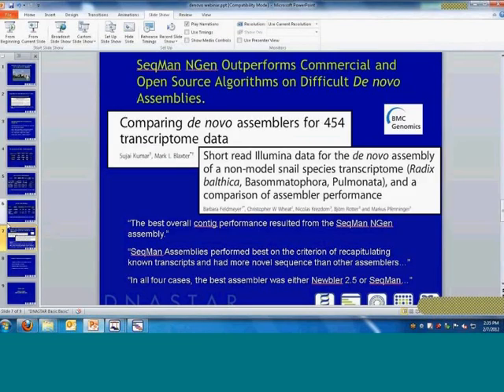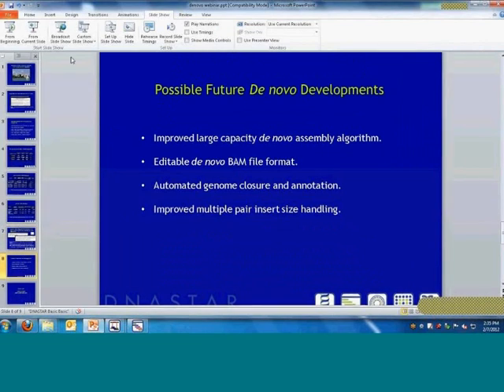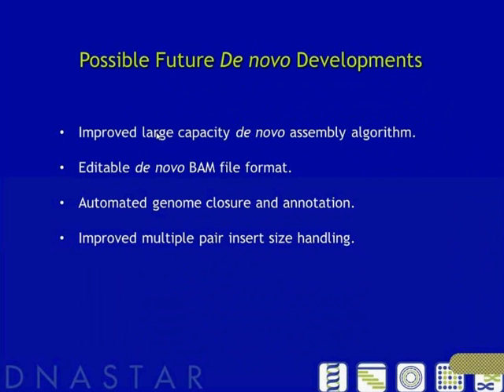So I guess a couple more things just to mention here. Some future developments. We're working on multiple different ways to improve de novo assembly. One thing that we are discussing now is an improved large capacity de novo assembly algorithm.